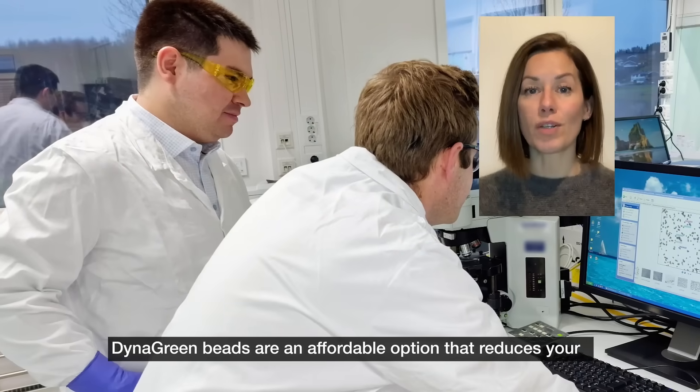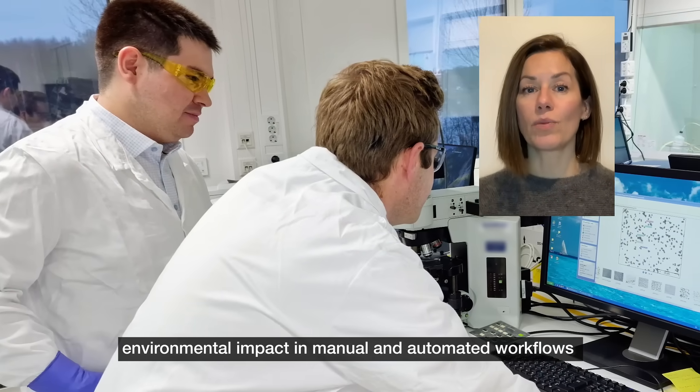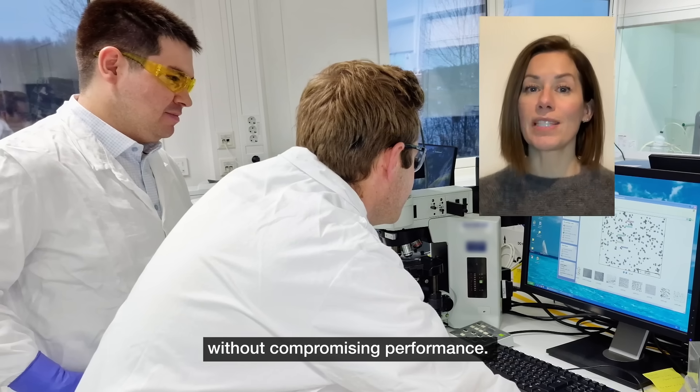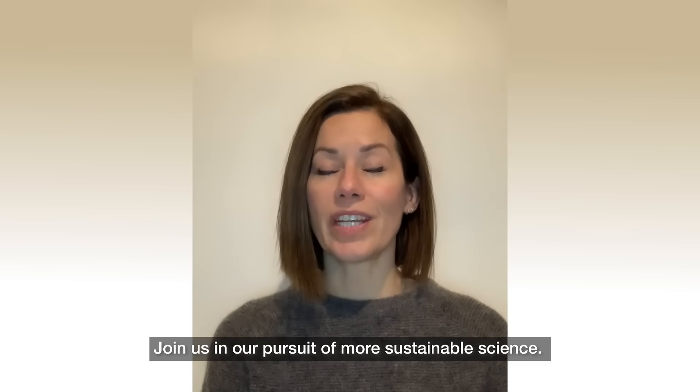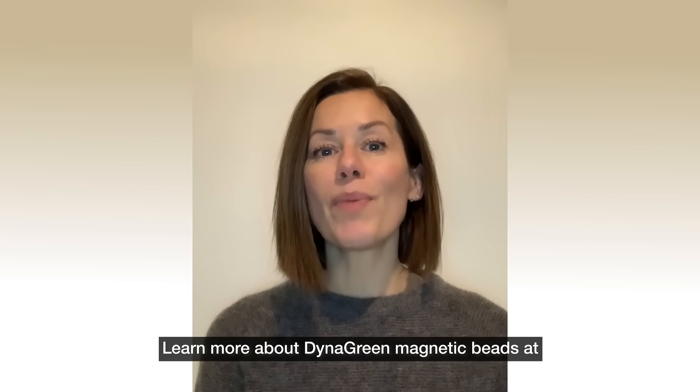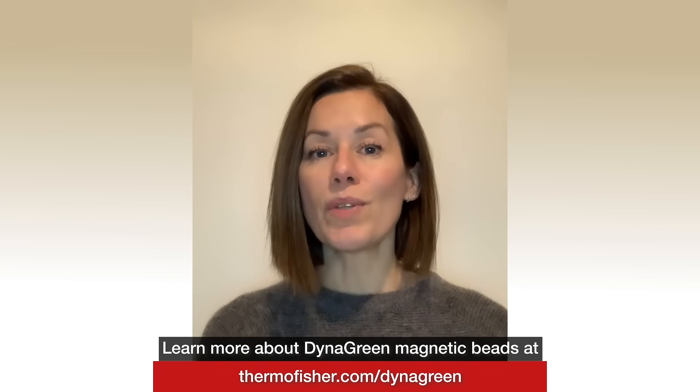DynaGreen beads are an affordable option that reduces your environmental impact in manual and automated workflows without compromising performance. Join us in our pursuit of more sustainable science. Learn more about DynaGreen Magnetic Beads at thermofisher.com/DynaGreen.